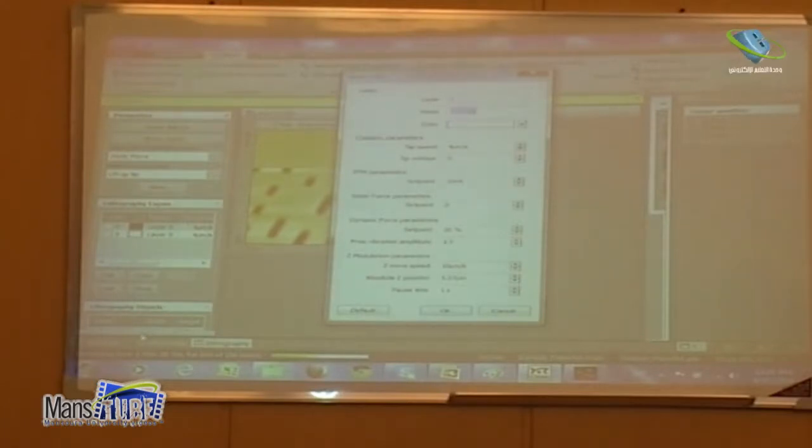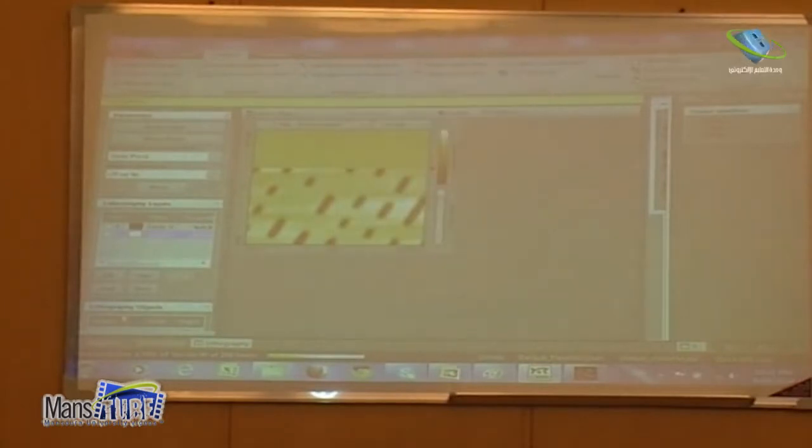If I use gray colors, different gray colors, we have different layers with different force. Okay, now I have 2 layers. So this is the black one, and you see this is, let's say, Yasin. Now it's like pixels, and when I want to make the drawing, he will make it in pixels.